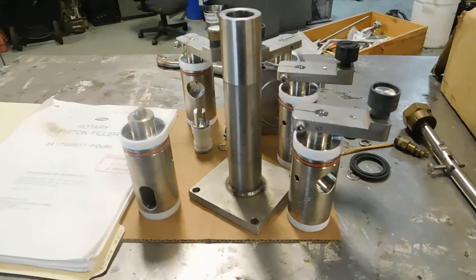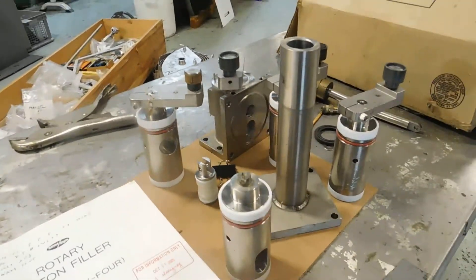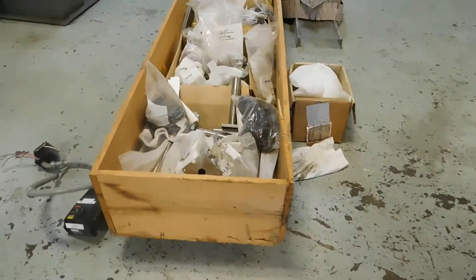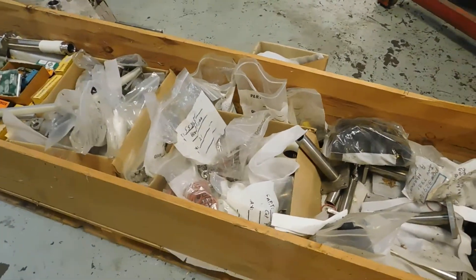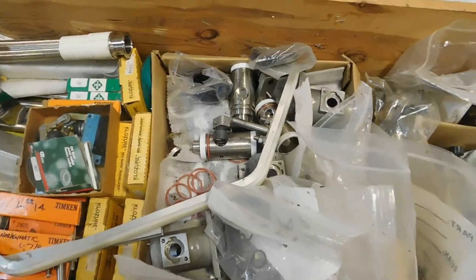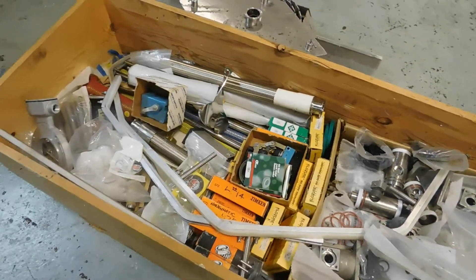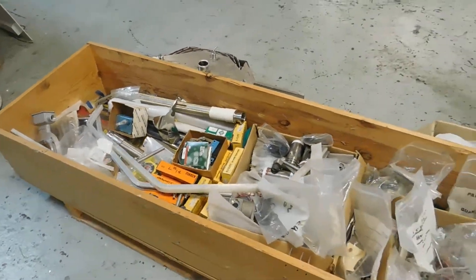Here's a look at some of the valves, the valve body, and one of the pistons. The remaining parts of the machine are in this crate. All kinds of spare O-rings, some of the valve bodies in there. And of course, there's a large cache of spare parts, including valves, seals, micro-switches, etc.